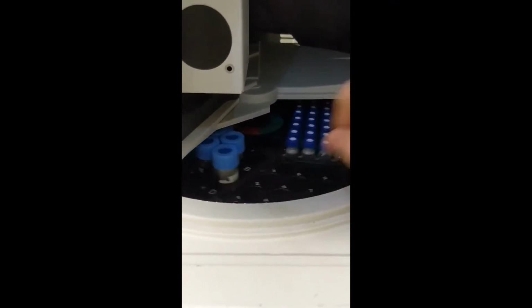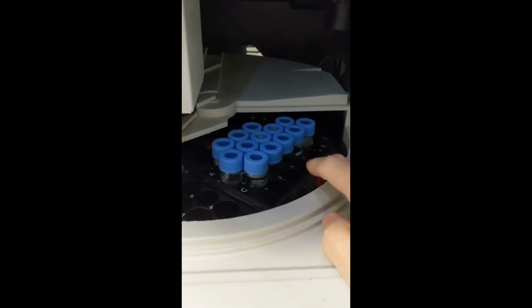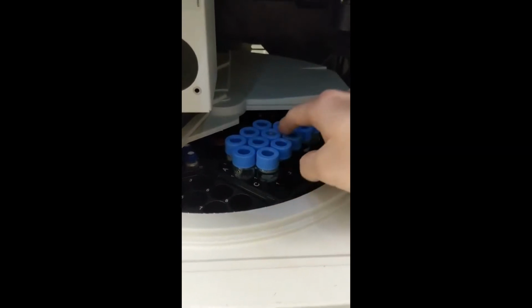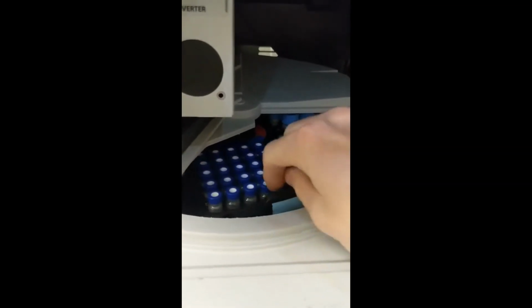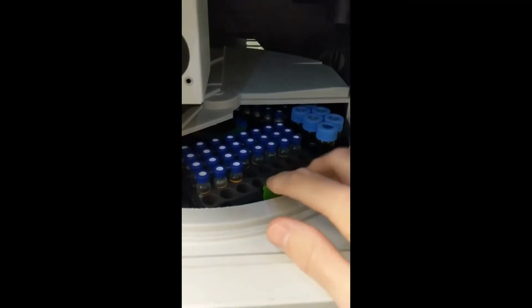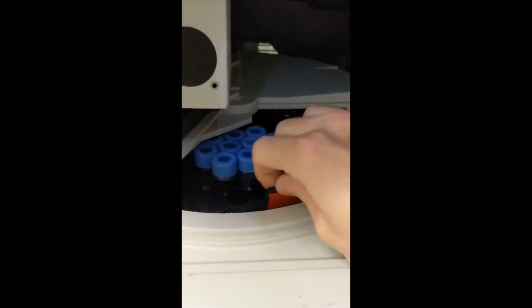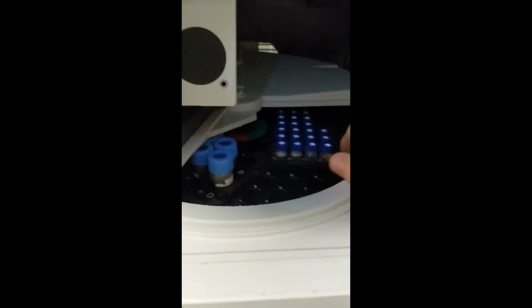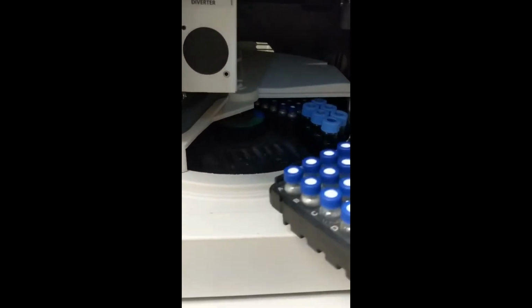You'll also see that there are different vial sizes. These ones are large; I believe they're 10 milliliters. We use these for our DI waters right here, our anion calibration standards, and our cation calibration standards. And then these blue and green slots we use for our actual samples. Just remember that you put your calibration curve in the red one: anions right here, cations right here, and then DIs right here. Just as an example, let's fill this green one right now.